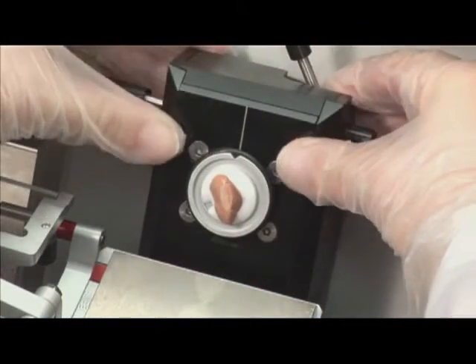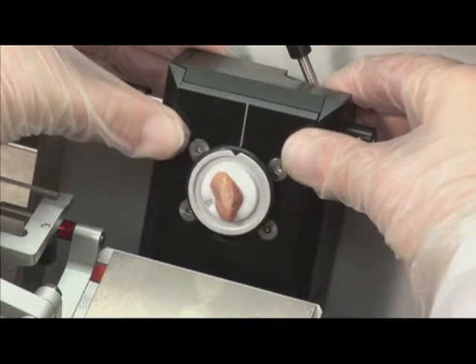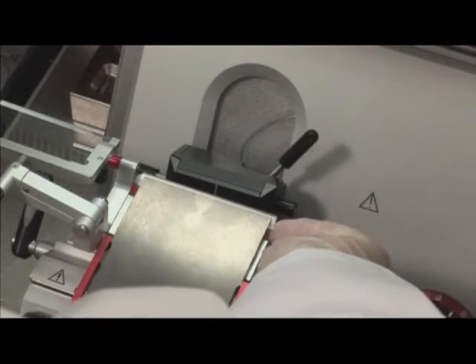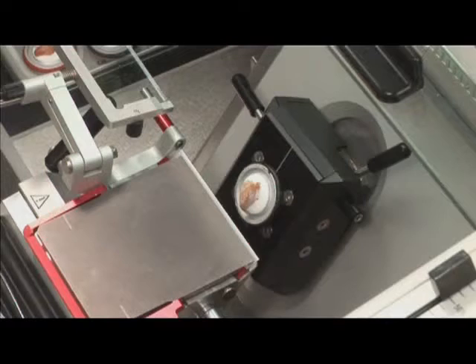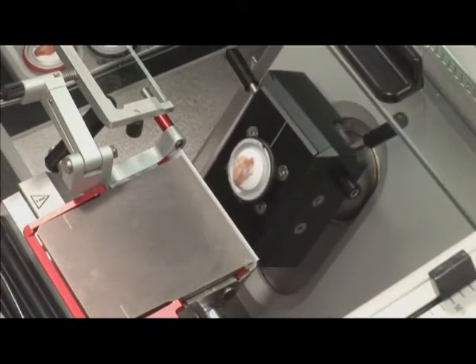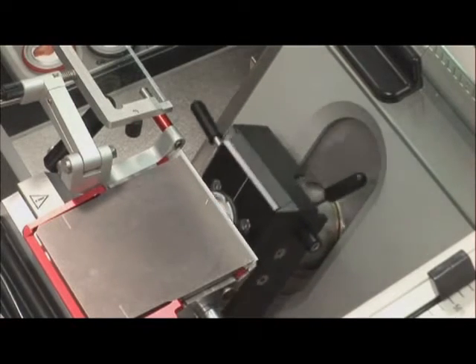The clearly defined zero position and the orientation mark on the specimen disc allow easy specimen alignment. The motorized object feed with two selectable speeds facilitates precise specimen approach to the blade.